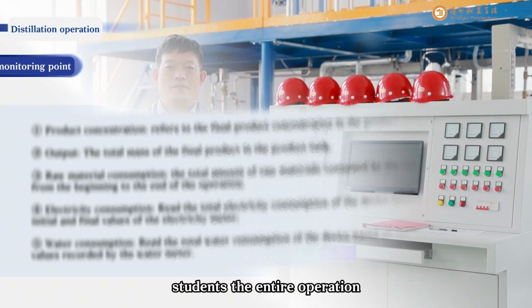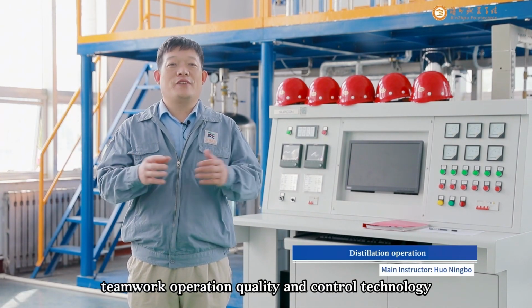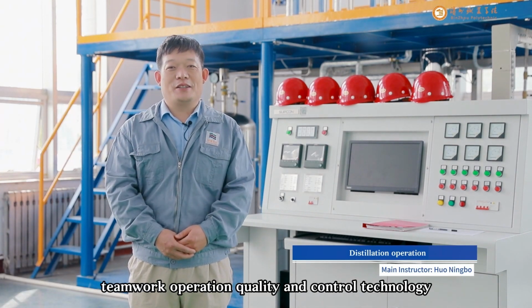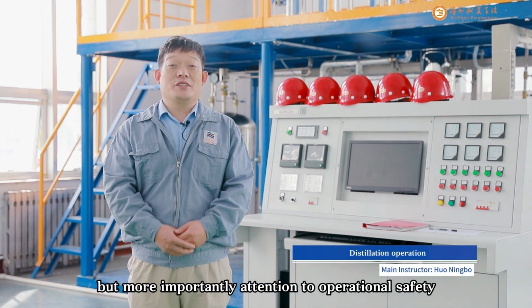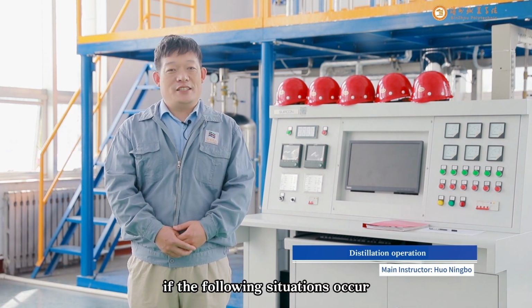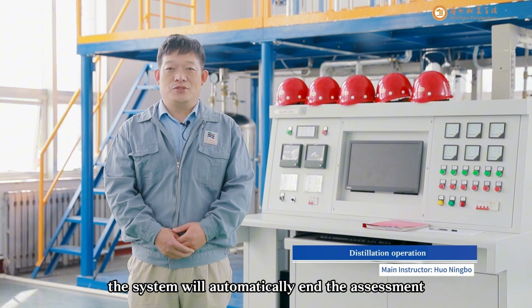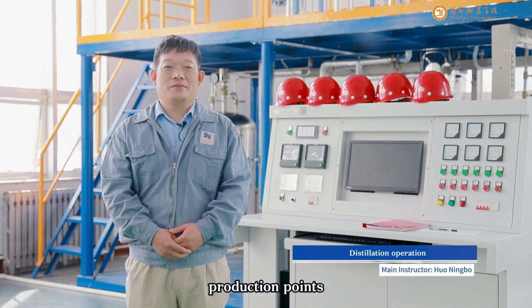Students, the entire operation assesses not only your standardized operation, teamwork, operation quality, and control technology, but, more importantly, attention to operational safety. Pay attention to the following items. If the following situations occur, the system will automatically end the assessment and deduct all safety production points.